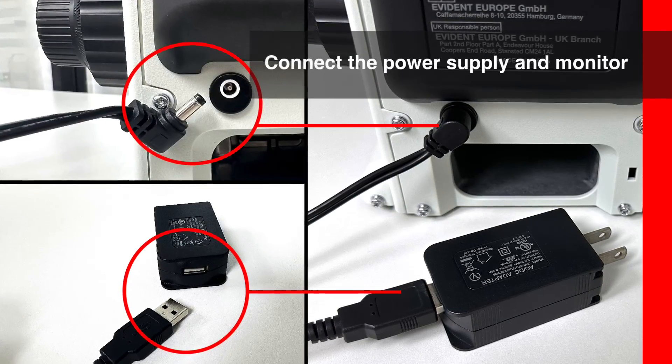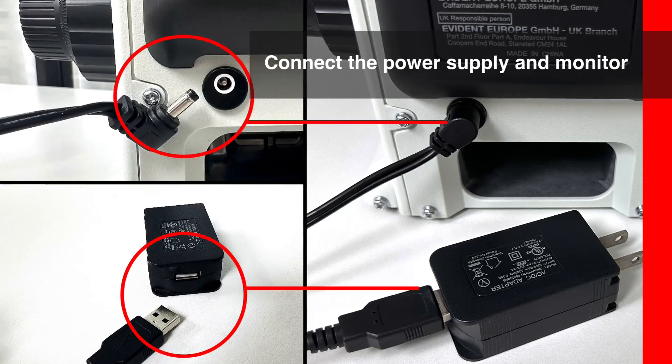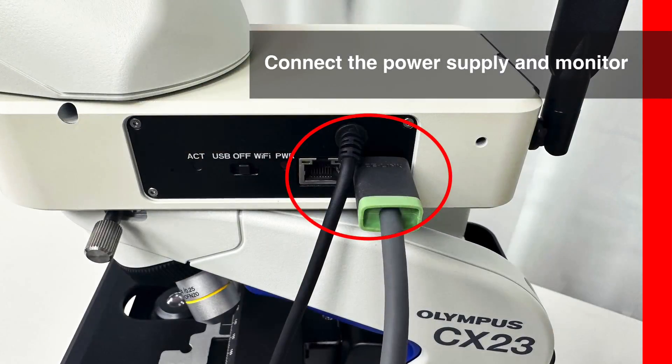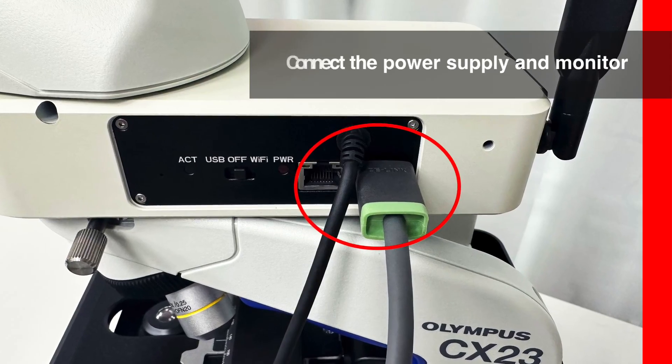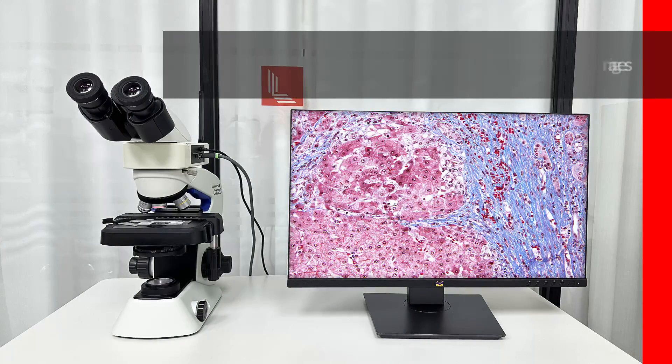The camera is powered by a USB cable. Use the adapter that comes with the camera to connect to the power supply. Connect the microscope's power cable and ensure that the HDMI cable and monitor are properly connected.